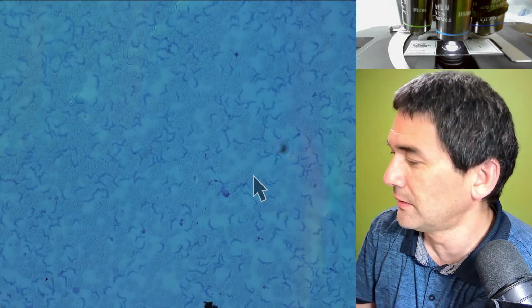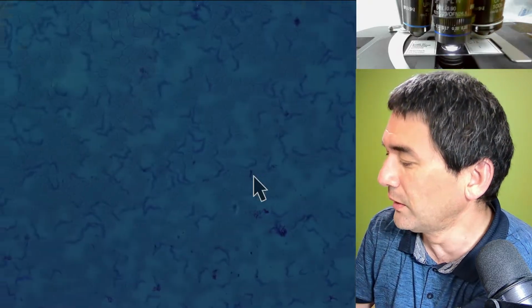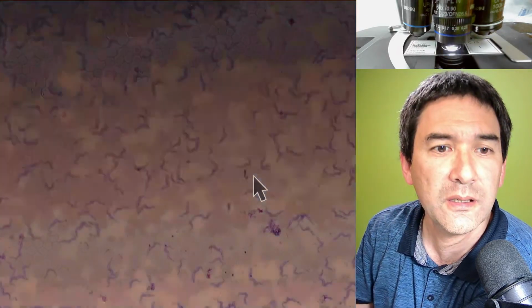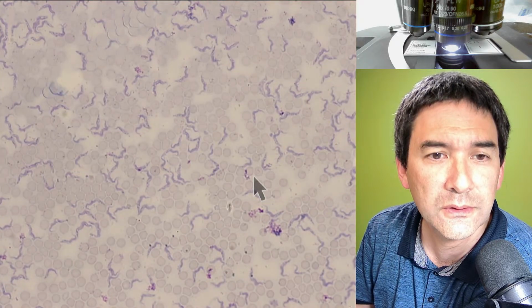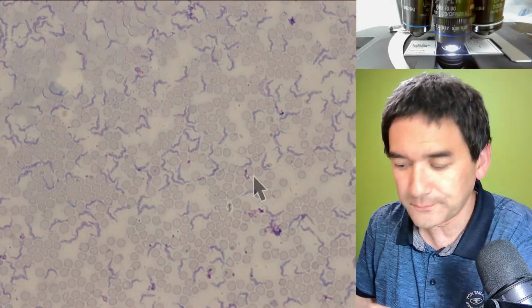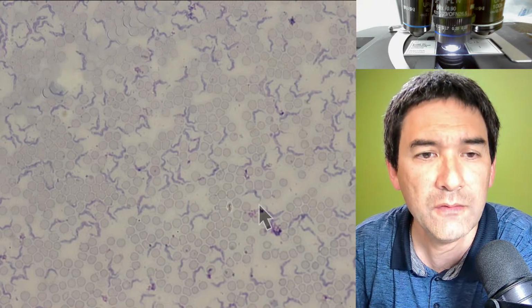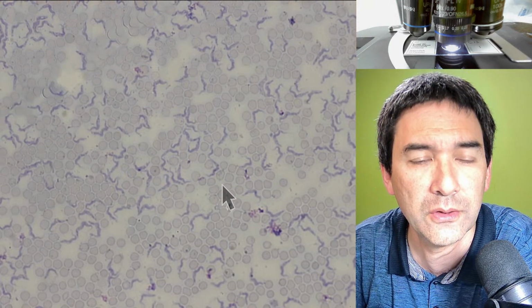You know what? This is not quite well visible yet. So here we go, I remove the filter. And that's also blood. I'll explain this here again. If you look very carefully, you're able to again see, very brightly over here, the red blood cells.